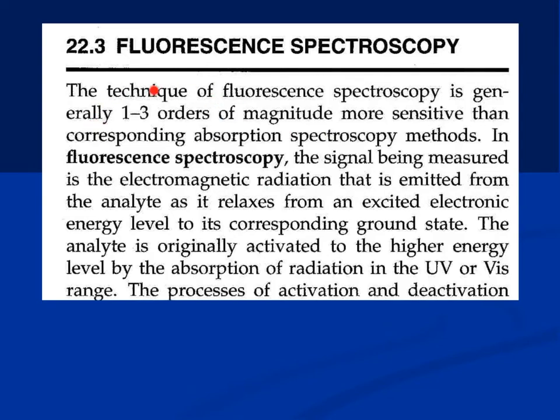It's more sensitive than UV spectrophotometry, and that's one of the reasons why it is used. Many molecules don't show UV, but when you excite them, they show fluorescence when the electron drops down to a lower level. So you are determining the emission, not the absorbance, in this case. The electrons are excited to a higher energy level, and then they drop down, so the process is activation and deactivation.